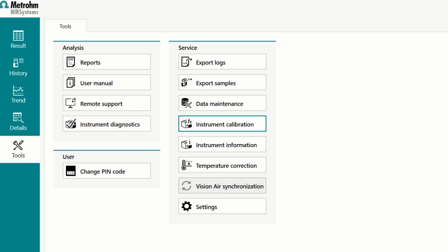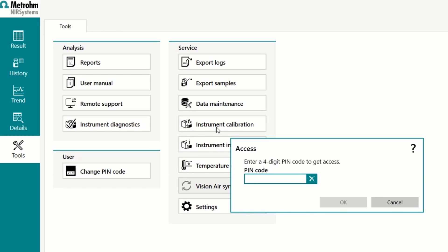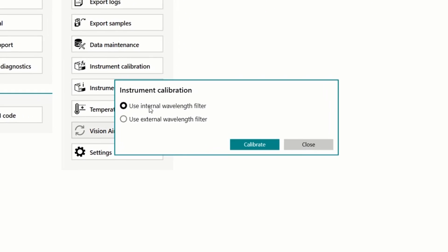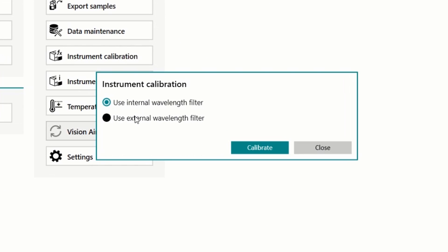When the diagnostic test fails, the first step is to recalibrate the instrument. For the instrument calibration, select the corresponding button under Tools in Vision Air. Enter your PIN code and choose between the use of an internal or external wavelength filter.